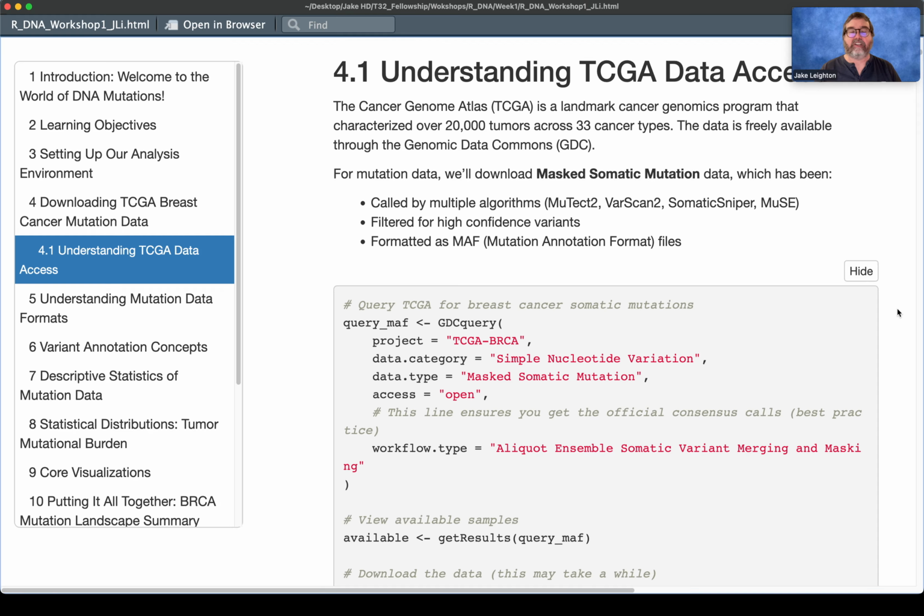It's the mutations. The mutations have been called by TCGA, usually MuTect. MuTect2 is a newer one, but probably the old MuTect. There are different algorithms that can call mutations, and that's basically what we have today, right? They've called mutations, annotated the mutations, and given us a final file that has all the information. That's great, we can work with that today, but how did they get that? You're not always going to have that, so I'll also show you how to get there too, right?